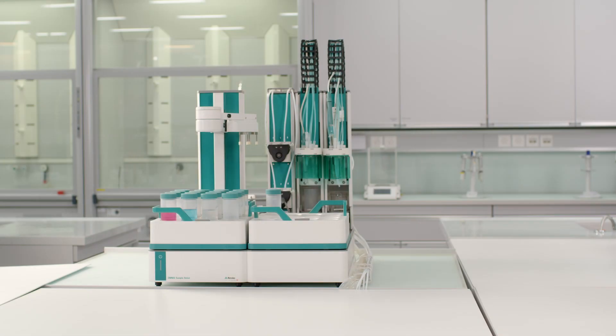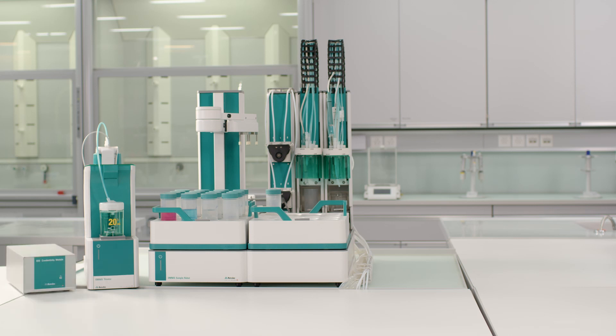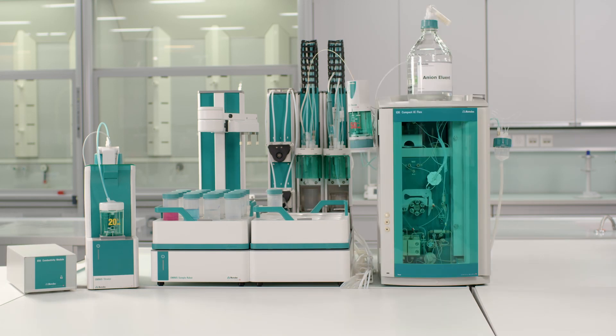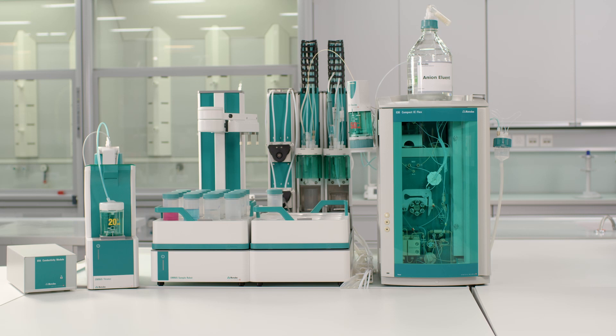Metrohm offers two versions of the TITRIC FLEX, both of which include an omnisample robot S, an omnis titrator and an 856 conductivity module. Depending on your ion analysis needs, the versions include either one or two 930 compact IC systems.